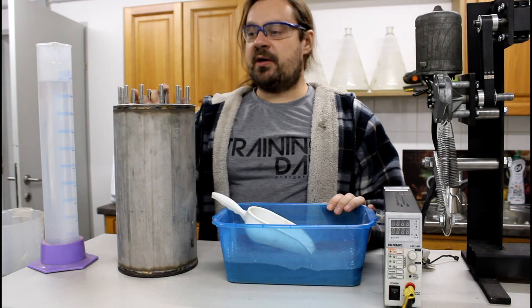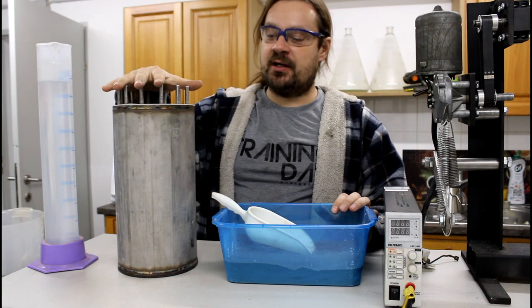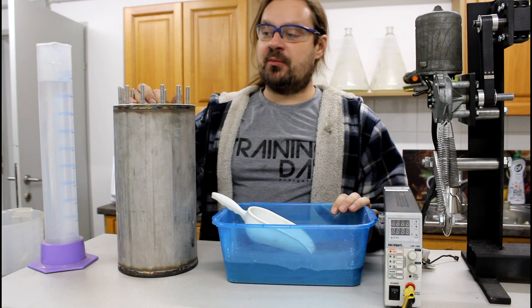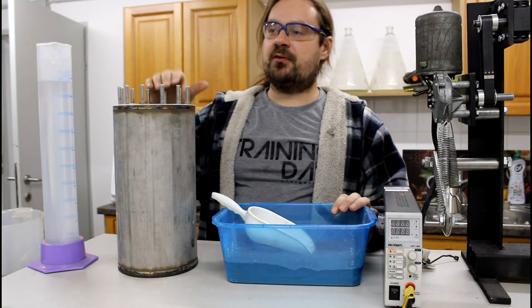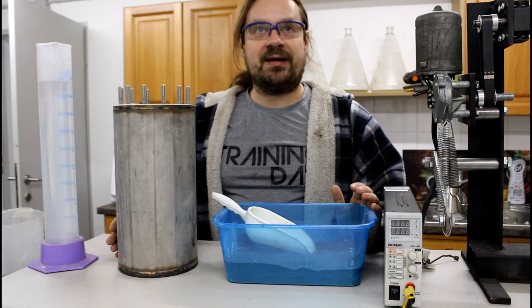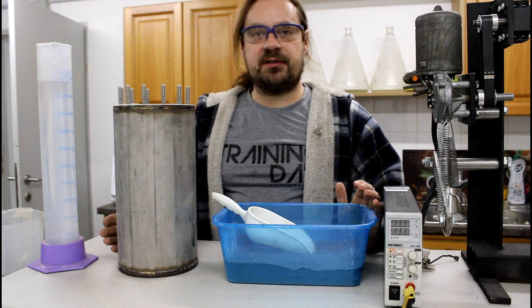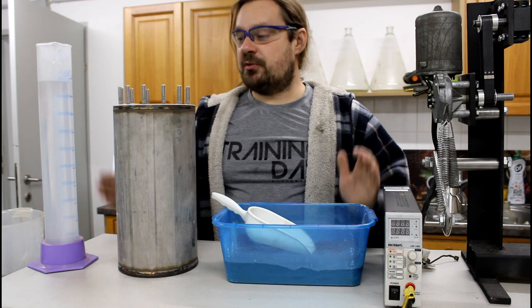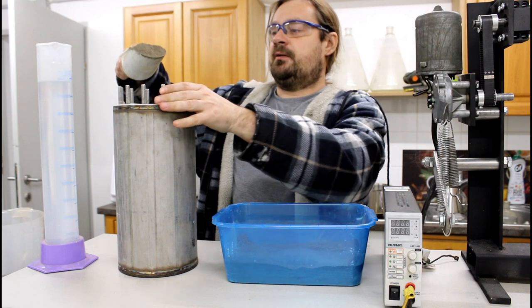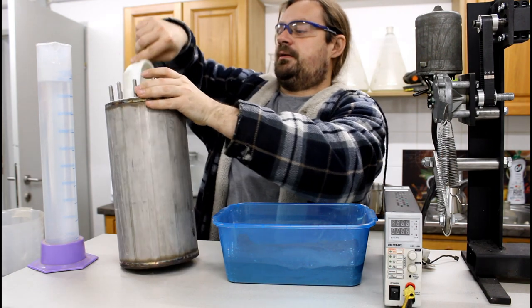So in this step we are preparing the mixture for the actual boil. For this reason I have made here a reaction chamber. This is a full stainless steel reaction chamber, and here is an adapter for a reflux condenser, meaning I can boil it easily for prolonged times like 24 hours without the need to refill water because of the reflux. So we are simply filling it up with the ore sodium hydroxide mixture. This should be done very carefully. There is a hair on mine. Okay.